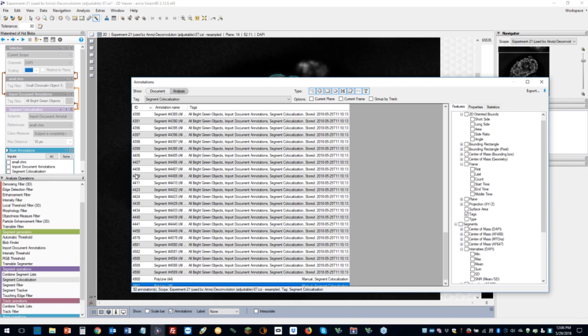They share all the information with us about the file format, which makes it really easy for us to catch all of the relevant information from their files. In this case, it's really as simple as a drag and drop.